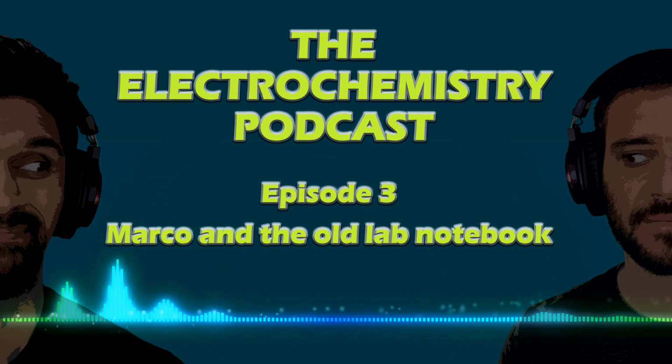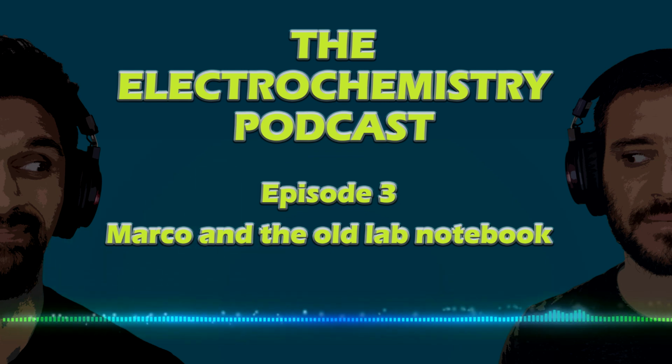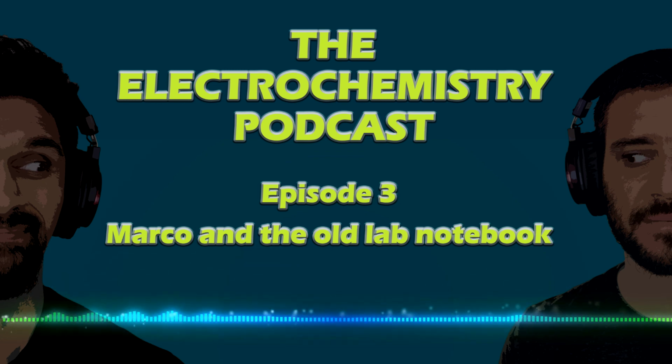Well, the only crime I see from this story is a mystical lab notebook from 40 billion years ago that gave our friend Marco some trouble and terrible experiment advice. Next time, I suggest reading the electrochemistry literature. Or listening to this podcast, because this kind of stuff is rarely taught in electrochemistry classes or any hands-on electrochemistry labs. Well, folks, I'm glad we were able to figure out that Marco probably just switched the working and counter electrode leads, which led to the compliance voltage issue. So remember, folks, double check your electrode leads and make sure you have the correct lead to the right electrode.